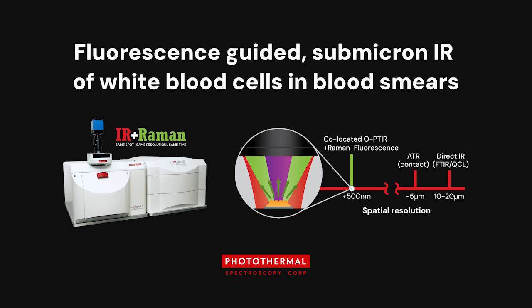first of all, we used the 785 probe laser. With 532, there were fluctuations in the spectra, because the red blood cells absorb 532 nanometer radiation, and so 785 gave much better spectra, but the background was still too high to get reasonable Raman spectra even with 785 nanometer excitation.